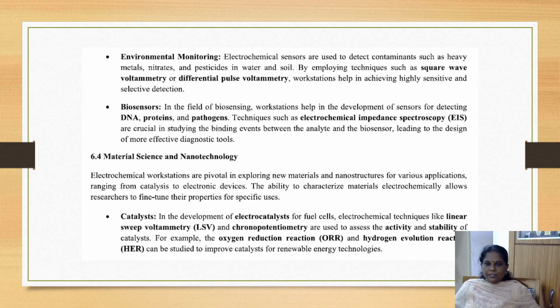Like catalysts. In the development of electrocatalysts for fuel cells, electrochemical techniques like linear sweep voltammetry and chronopotentiometry are used to assess the activity and stability of the catalyst. For example, the oxygen reduction reaction and hydrogen evolution reaction can be studied to improve catalysts for renewable energy technologies.